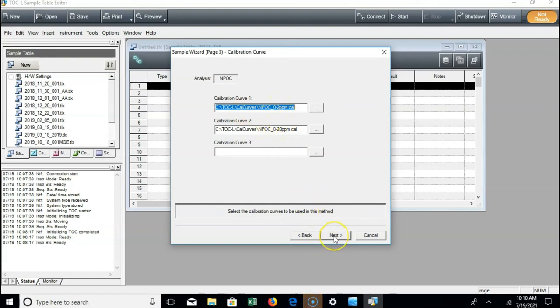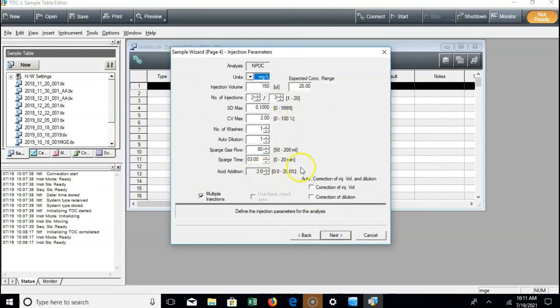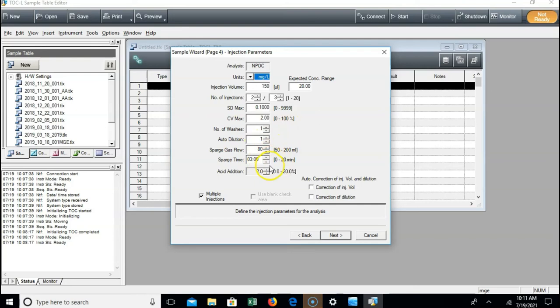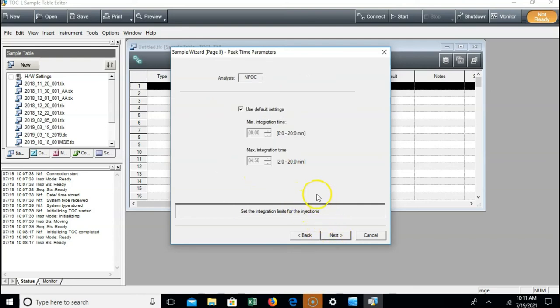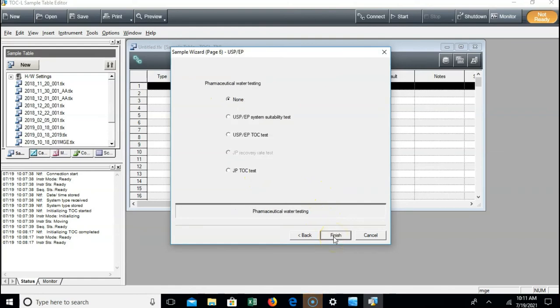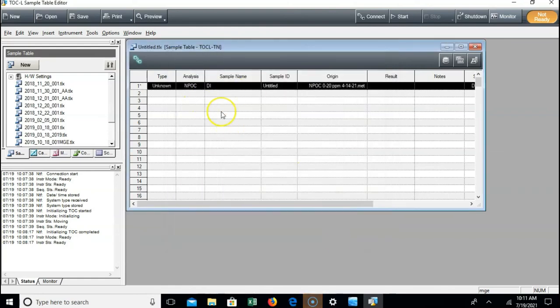This particular method uses two calibration curves — one for low concentrations and one for high concentrations. The method tab is mostly related to method settings, and you probably won't have to change anything. There are options like injection volume, expected concentration range, and number of injections — it'll inject up to that number, or as many as it takes to get within your specified standard deviation of 0.1. There are also options for washes, auto dilution, acid addition, and sparge gas flow rate and sparge time. Most of the time you won't be changing anything here, and the next two pages you can skip through — then it inserts your DI water.